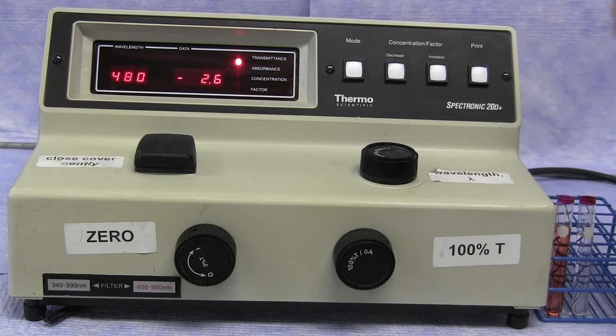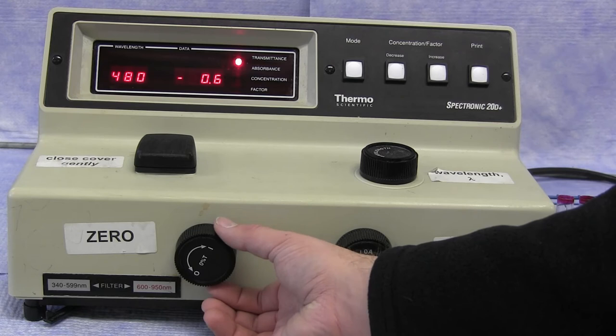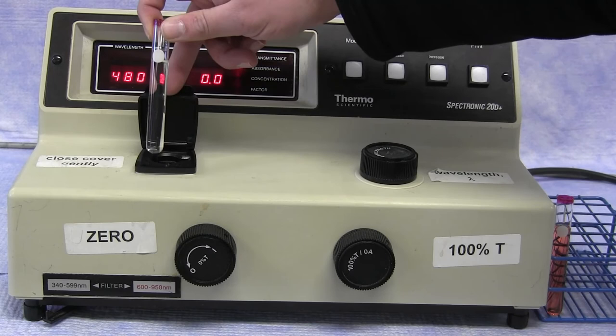To begin the calibration process, which is done at each wavelength, you can first use the left control knob to adjust the reading to 0% transmittance. This is done while the chamber is completely empty. When the instrument is adjusted to 0% transmittance, you can then take a cuvette containing your solvent, typically water, and place it in the holder.